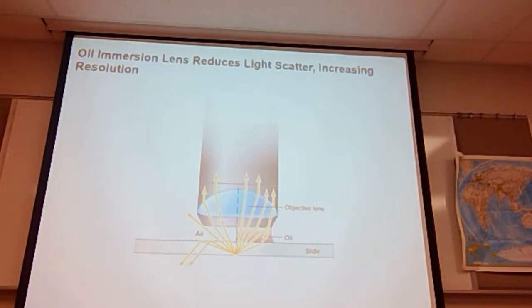And what happens as light passes through the glass is that many of those light rays will want to bend. So you see how these two have hit here and they've bounced back down. This one's come off at a weird angle. And so you've got 1, 2, 3, 4, 5 beams of light represented, but only 2 of them are going through the image and making their way to your eyes. So 40% of the light is doing its job.